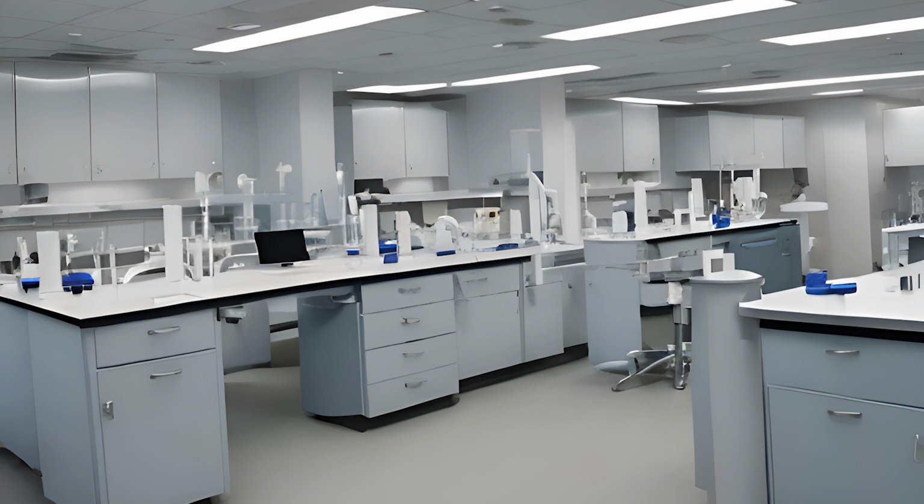Every individual chemical manufacturer is going to make their own label that they're putting on the chemicals they send you. There are a few standard things, such that all labels are going to list the name of the reagent that is in that container. They're going to list the concentration of the reagent that is in that container, any storage requirements for storing its safety, the date that that chemical was made or when it was put into use, the date that chemical expires. And you yourself will initial it when you first open that container. So that is how you get the date of when it was placed into use. You'll write the date that you open that bottle, and you'll initial that bottle as open.